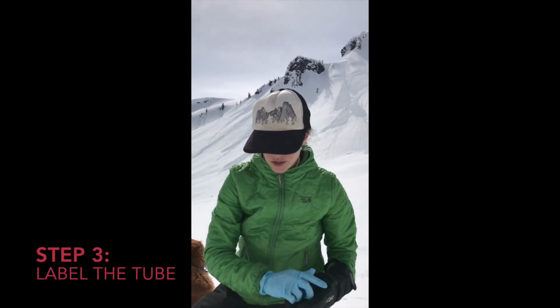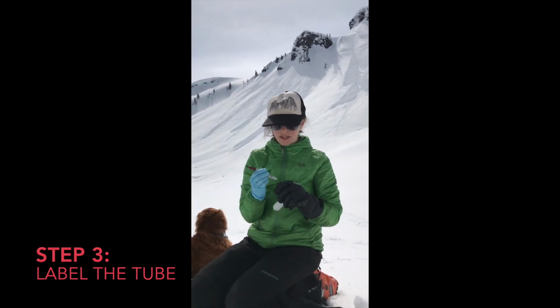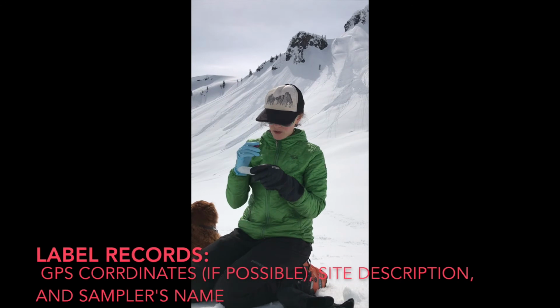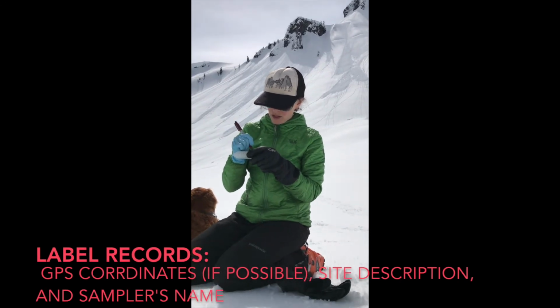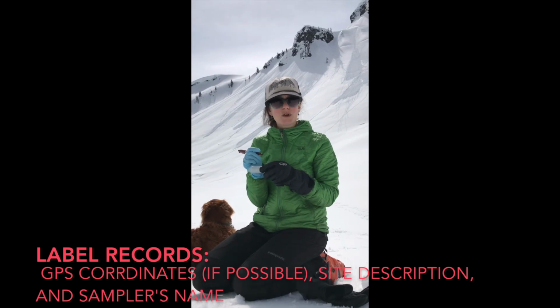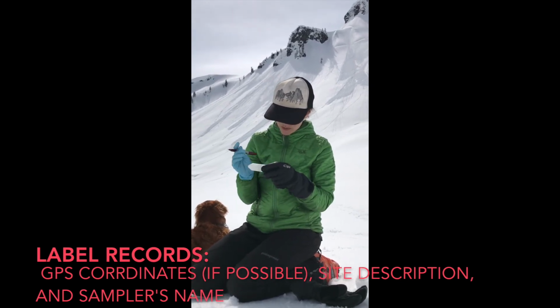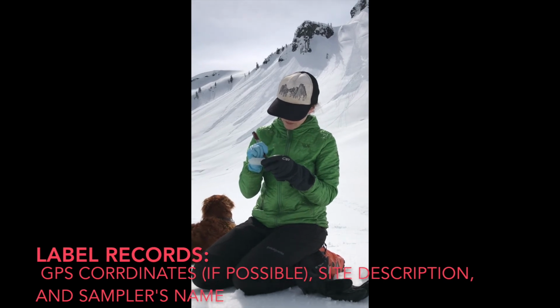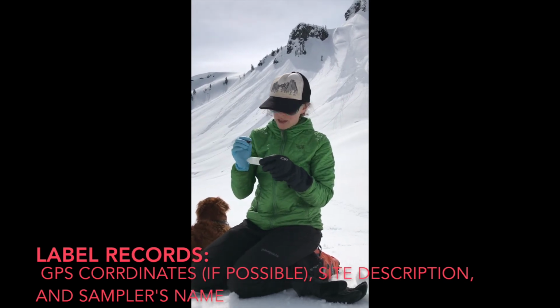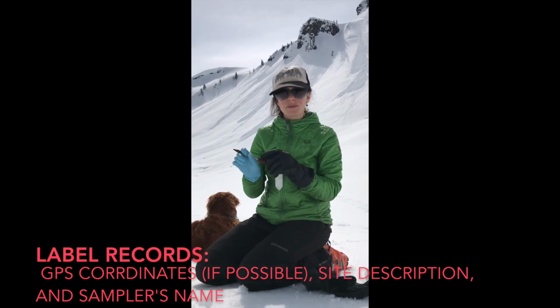And then you want to record the information on your label, which includes the GPS coordinates. So you'll write your GPS coordinates, where you are approximately, and we are right below Herman's Saddle, right next to the Mount Baker ski area, so I'll call this below Herman's Saddle. And then you want to put your name on it so we know who took the sample.